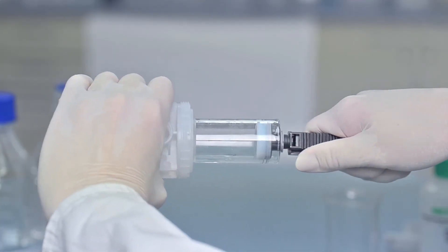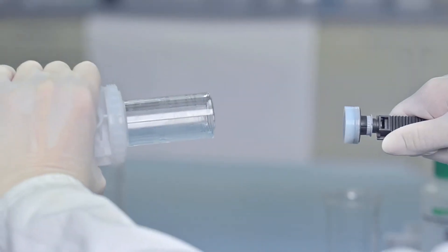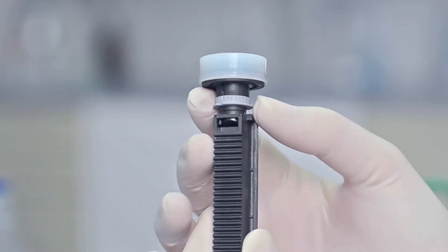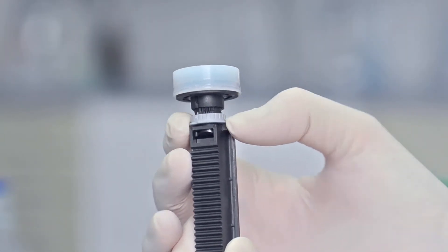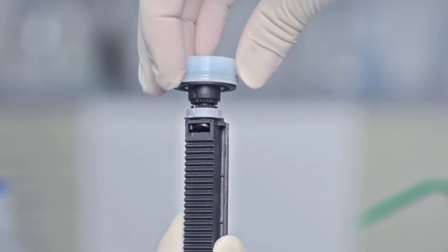Then pull the piston rod and attached piston out of the dispensing cylinder. Slide the light grey safety ring of the piston rod downwards, then unscrew the piston.